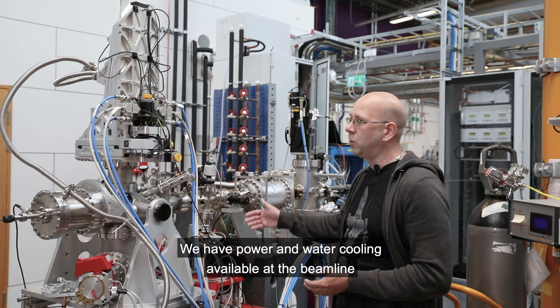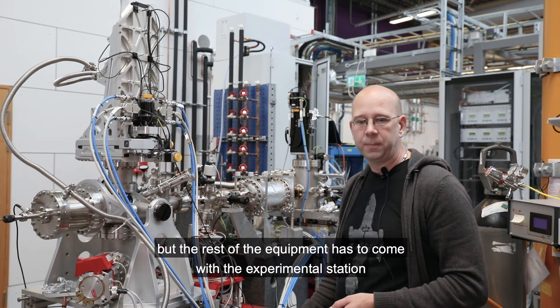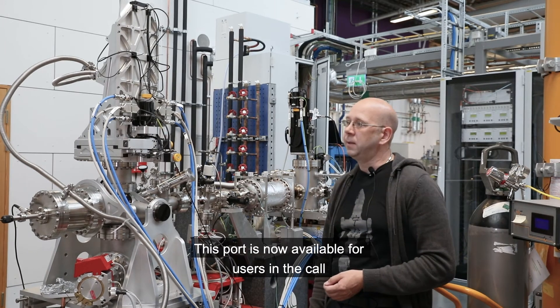We have power and water cooling available at the beamline, but the rest of the equipment has to come with the experimental station. This port is now available for users in the call.